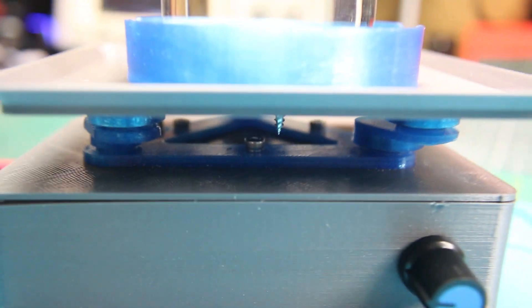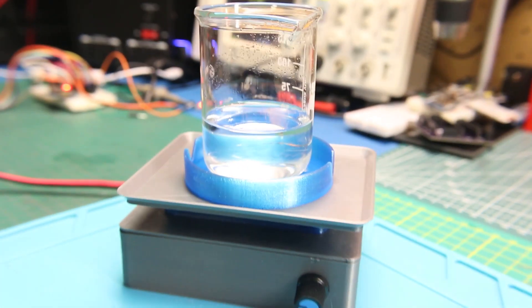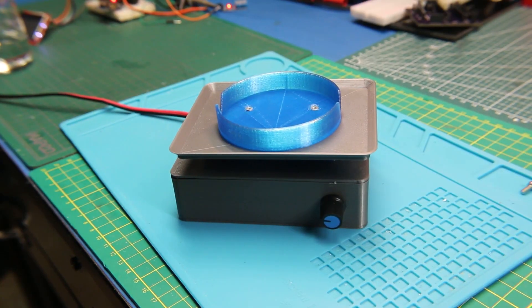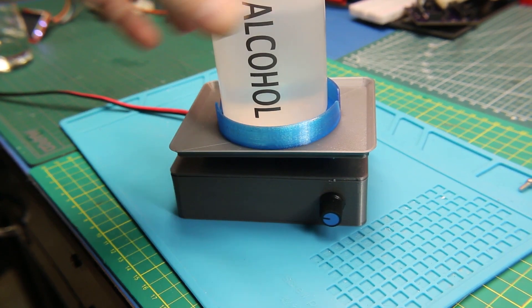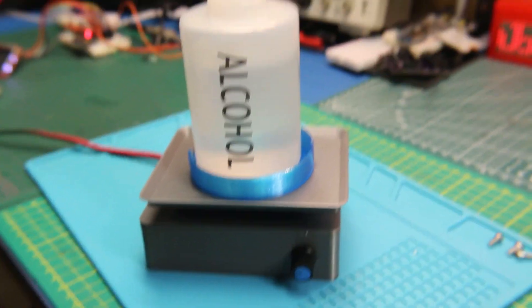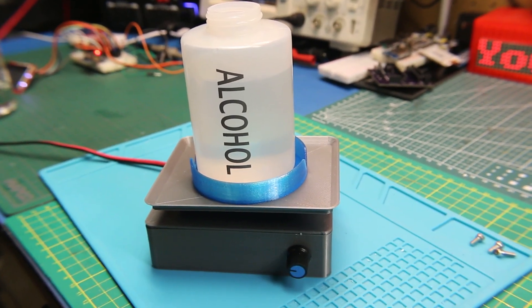And this is the end result. Pretty cool for just 3D printed parts and a few handfuls of electronics and bolts and hardware. Just wonderful what we can make.